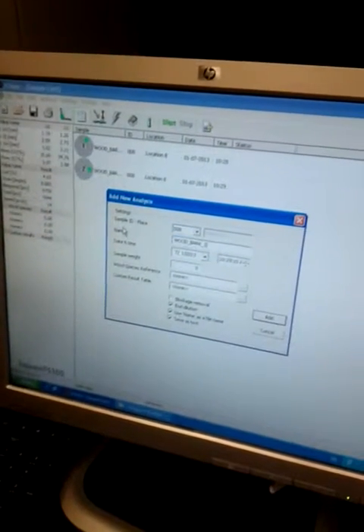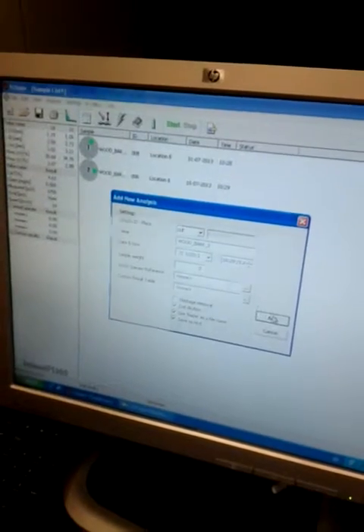For example, fiber 3, and then after the third of wood bark, if you're going to analyze wood species, I recommend you do a rinse, just to wash everything, to take off all the wood bark fibers, and just to analyze wood species fibers.